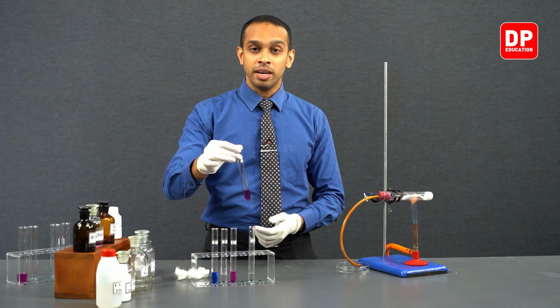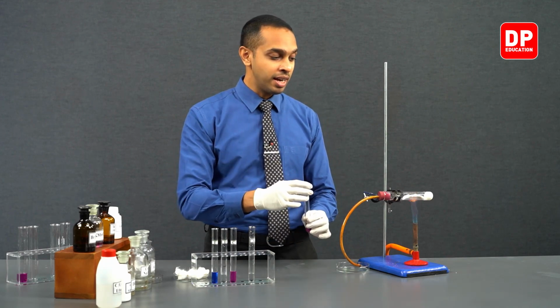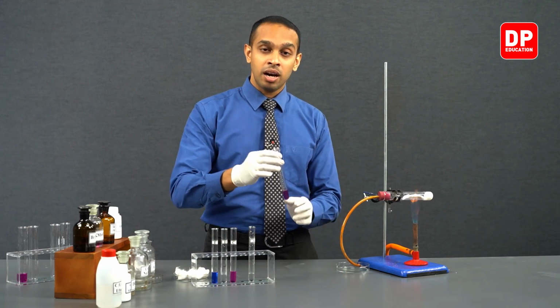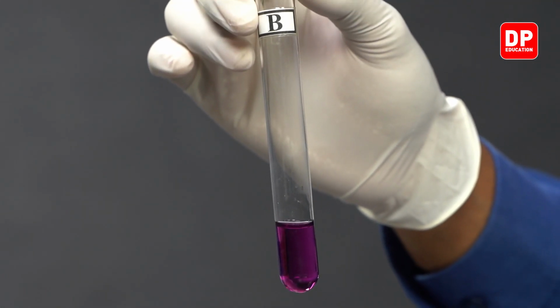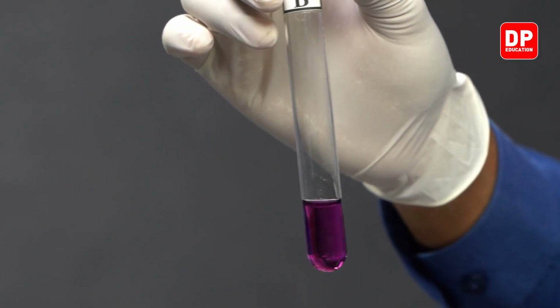Let's try and react this ethene gas with our contents in test tube B, which is alkaline potassium permanganate solution.